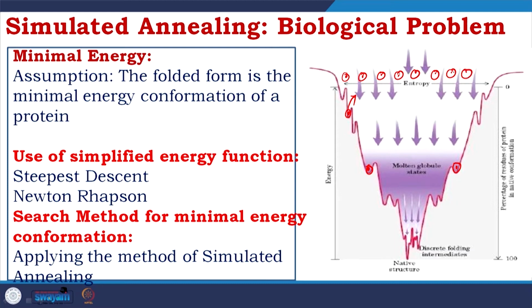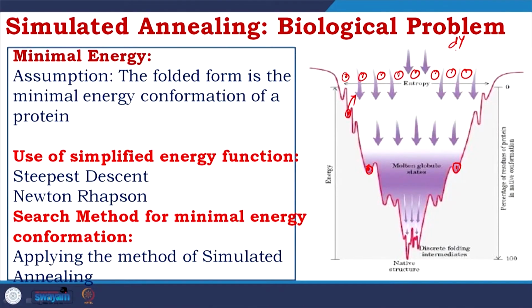So, these were there, I provide heat and they are here. Now, they are cooling down. How do you know they are coming to a minima? First of all, you use that random number as a function and you perform dy/dx. When dy/dx equals 0, you are confirmed that you are at a peak.